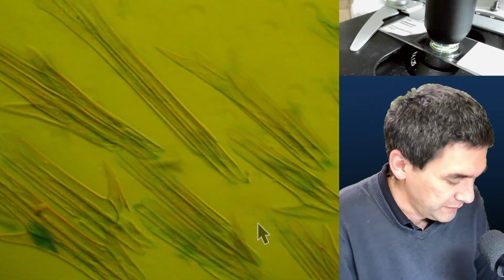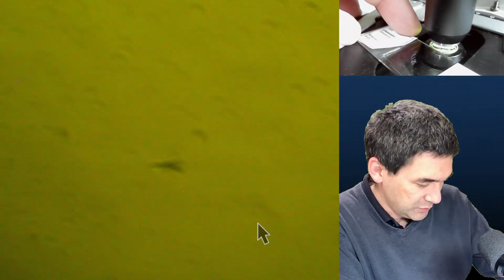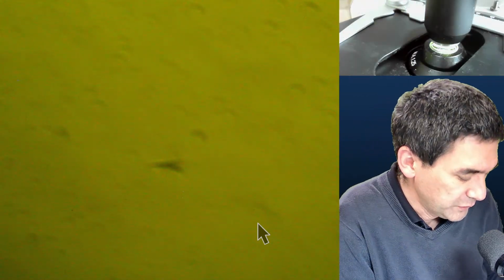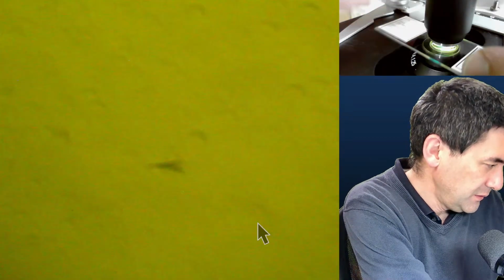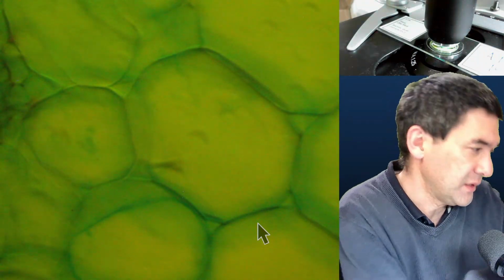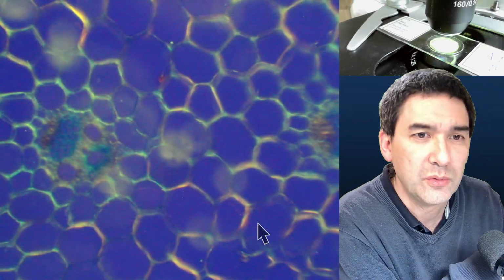So do you have anything left here? This one here is maize. And the last one that I have here is, what is this? Some starch grains from a wheat grain. Yeah, here again, that is now the maize cells. It's way too much magnified, I think. See over here, it's again too dark.